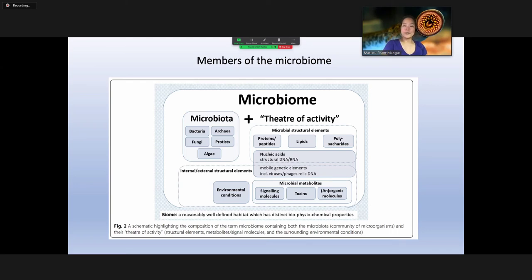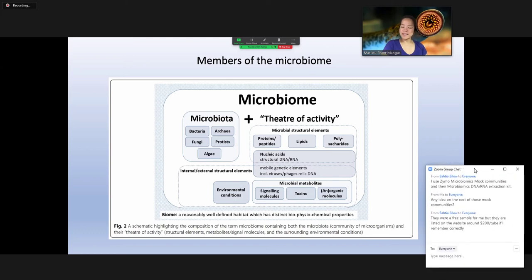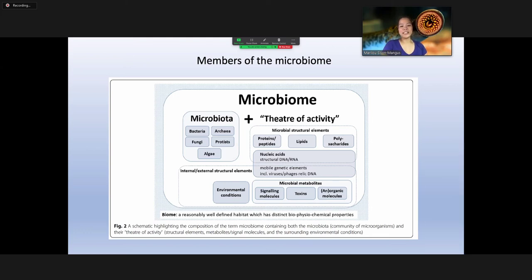Daphnia have their food, which are algae as well. These are aquatic organisms. I don't know about mice, if they're eating algae. So we don't know. For humans, we do know that they eat a lot of plants, vegetables, but at least it's not alive. But we can get chloroplast actually from those samples too, if you're sampling the fecal microbiome. Hopefully it gets degraded, but sometimes it's in there. And of course the mitochondria as well gets amplified from those samples too. So that's something that you need to remove when you analyze data.